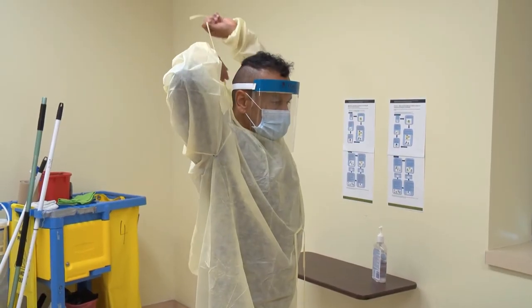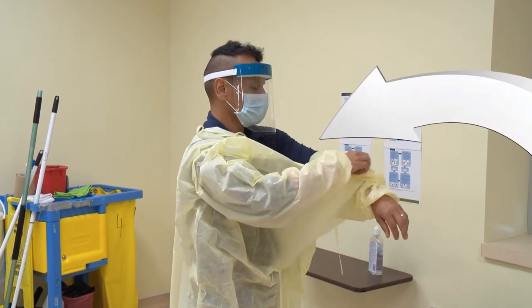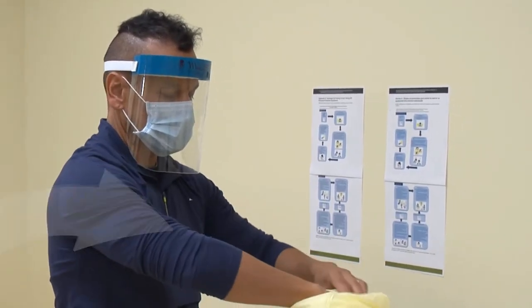Gently slip the shoulders of your gown forward to expose the inside. Grab the inside of the shoulders of your gown, making sure not to touch the outside, pulling it forward and away from your body.